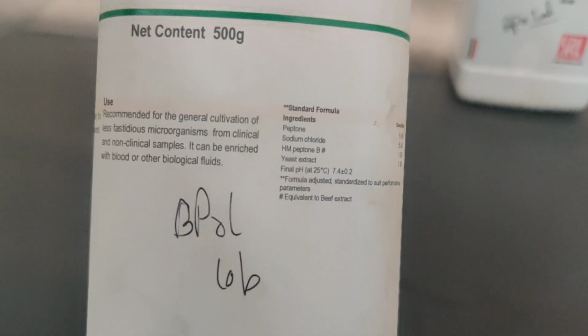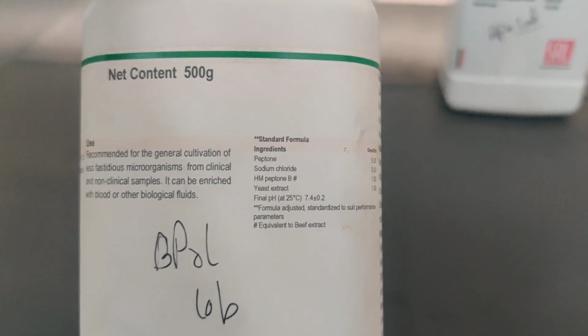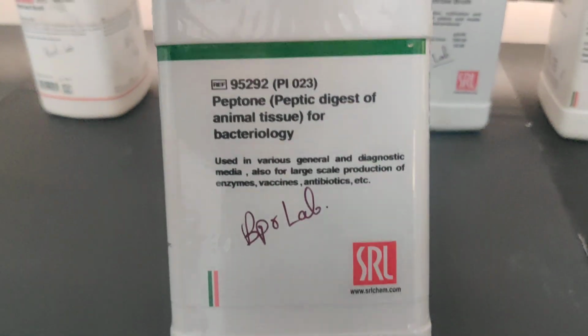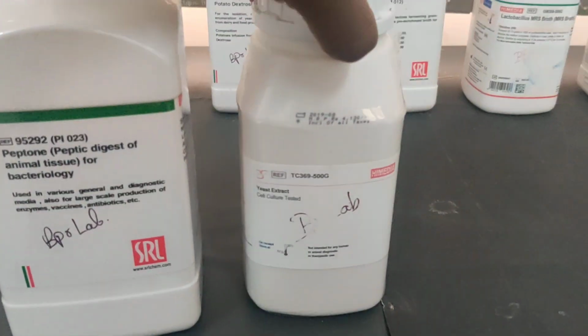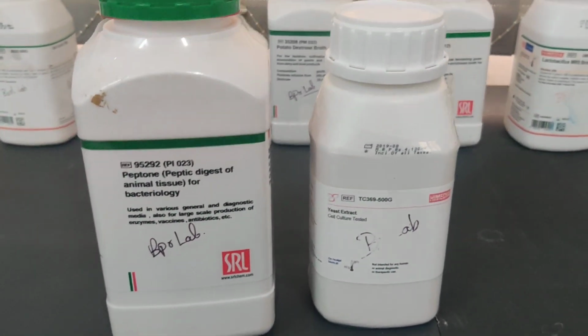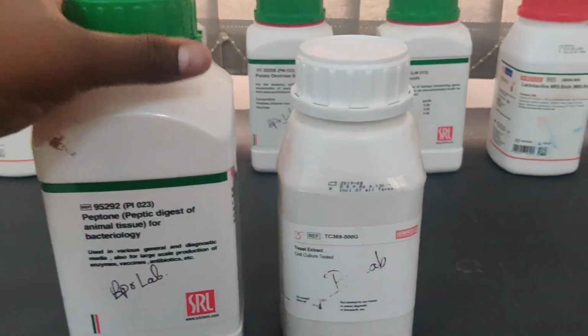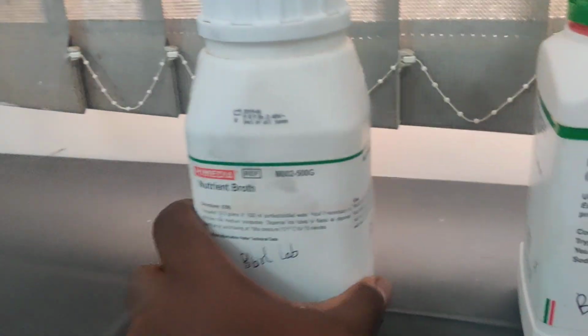You know, for nutrient broth you need peptone, sodium chloride, HM peptone, and yeast extract, and then you can select a medium. You can just take peptone separately, and then take your yeast extract separately. The components are available separately in laboratories. So it depends; if you get a medium where everything is together, like nutrient broth, you can easily depend on that.